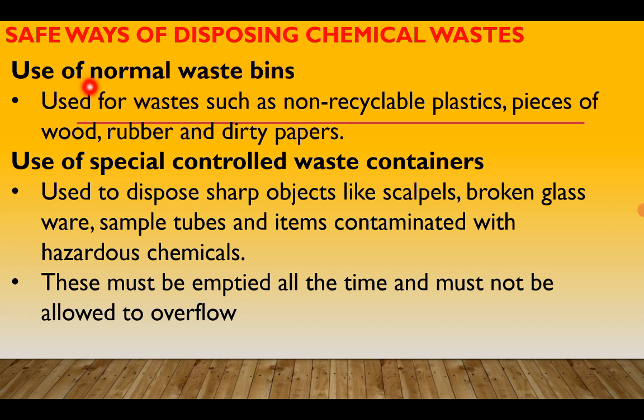One way is to use normal waste bins. So we have waste bins that are placed strategically in the lab so that as the wastes are being generated, you can dispose of them by simply throwing the waste into such waste bins. This technique is used for waste such as non-recyclable plastics, pieces of wood, rubber, and dirty papers.